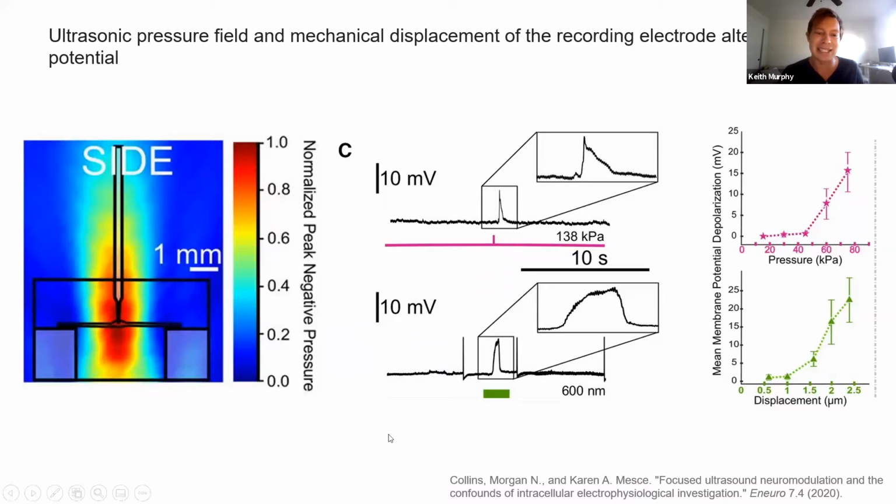I think the idea here, though they don't discuss it in the paper, is that if you have a voltage that's very sensitive to field placement, so these fields are very small, and you move the entire recording electrode, you're moving it across this field. So you may get a deflection that looks as if a voltage change is happening when really the change is just where you're measuring in that voltage field. Does that make sense, Kim? Am I doing that justice?